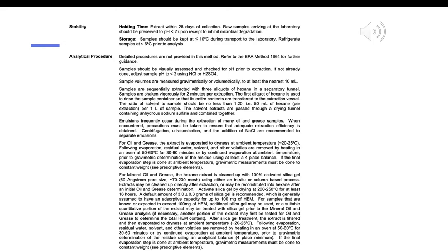The solvent extracts are passed through a drying funnel containing anhydrous sodium sulfate and combined. Emulsions frequently occur during the extraction of oil and grease samples. When encountered, precautions must be taken to ensure adequate extraction efficiency. Centrifugation, ultrasonication, and the addition of NaCl are recommended to separate emulsions.